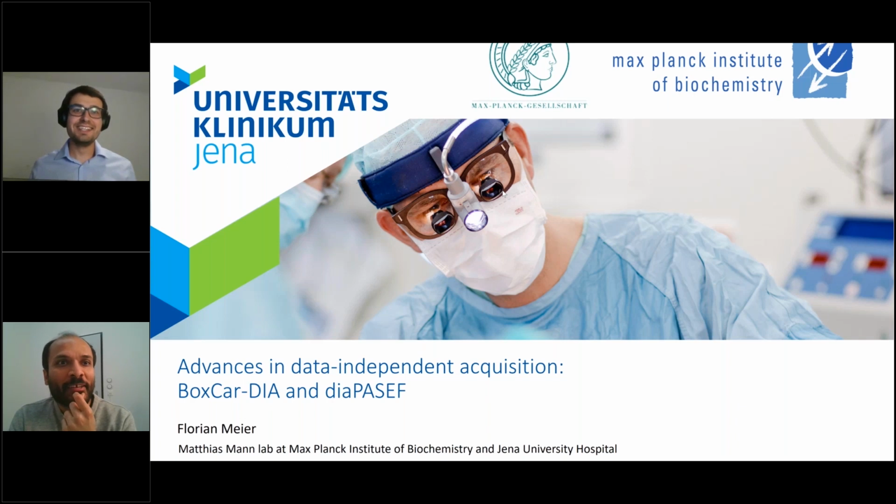I have a question here. Can the BoxCar DIA method be used with FAIMS? It kind of connects to the second talk. Yes, excellent question. I actually have the very same question. I haven't had the time to test this yet and see how it performs, but in principle it should work. So the BoxCar DIA is implemented on, I think, both the Exploris and the Eclipse platform. So the scan mode is there, and in principle one should just hook up the FAIMS device in front.